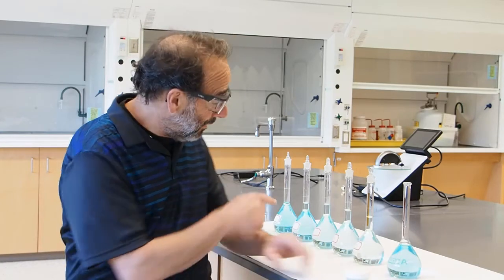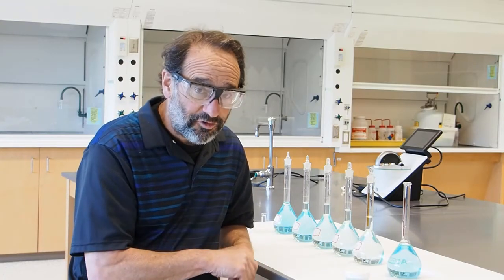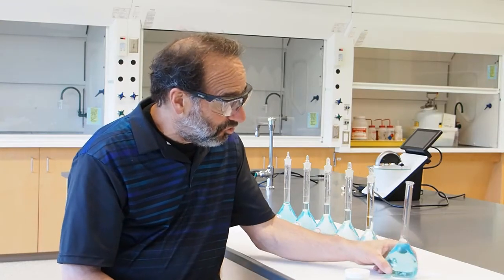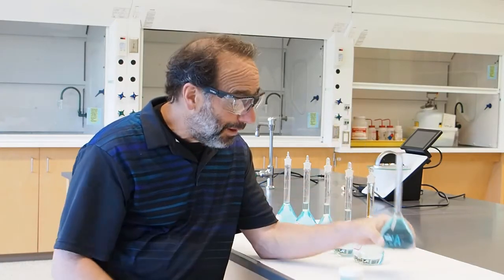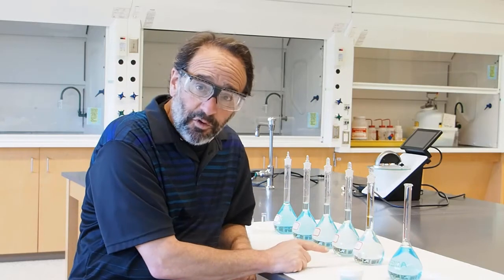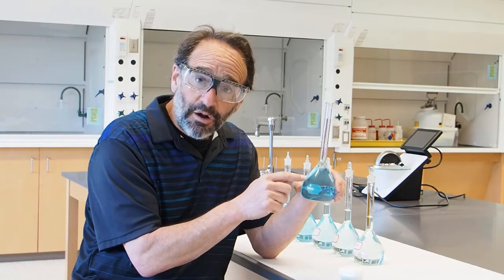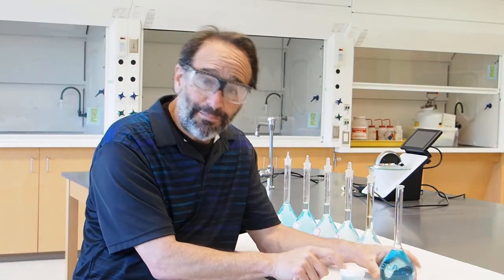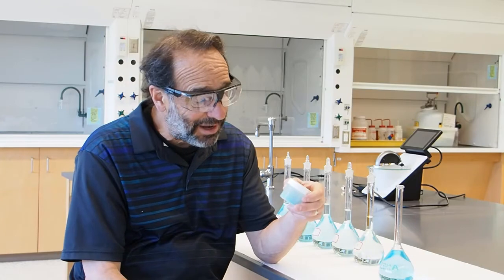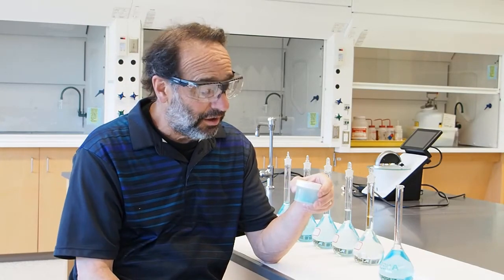So what we've done is we've made up a series of standard solutions of copper, for which we will measure the absorbance, and we've made up a solution that contains a known mass of our copper 2-chloride sample. And what we'll be able to do is make a working curve from the known solutions and then figure out the moles of copper in here, and from that be able to figure out the molar mass of our copper 2-chloride sample, and from that determine whether or not any waters have been lost or not.